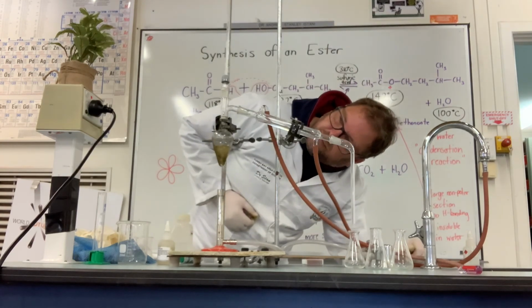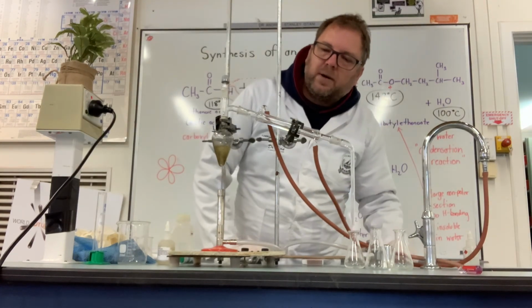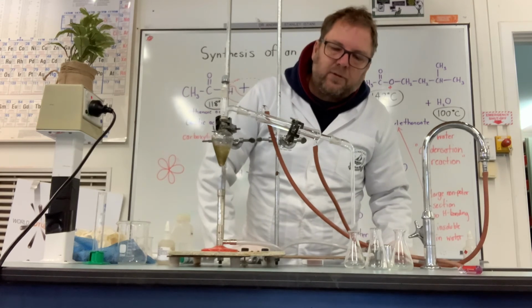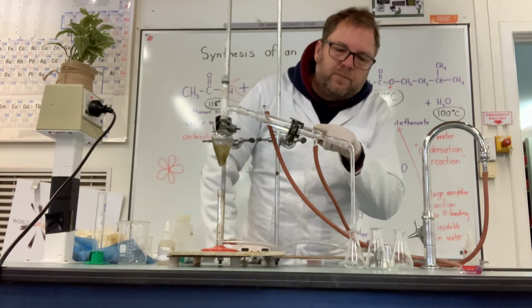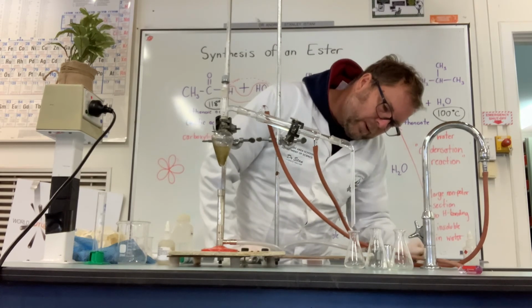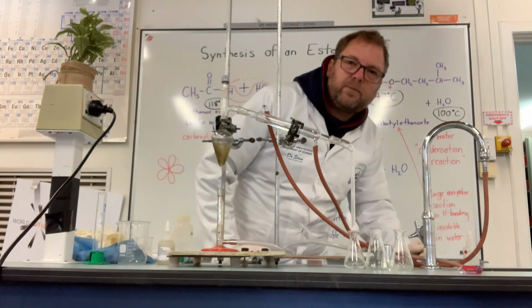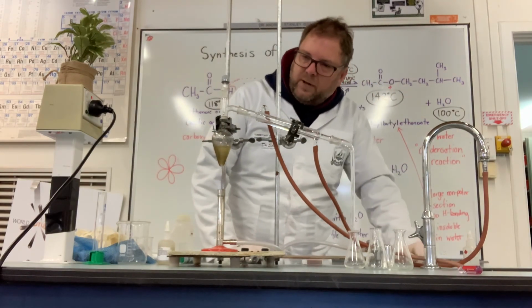They're condensing still up here. We don't really want them to condense here. We want them to condense in the tube. But no, I can just see some liquid starting to come through now. It's just running down. I don't know if it's coming up. You should see a drip very, very soon. There's a drip forming. Drip. There goes the first drip into that flask.